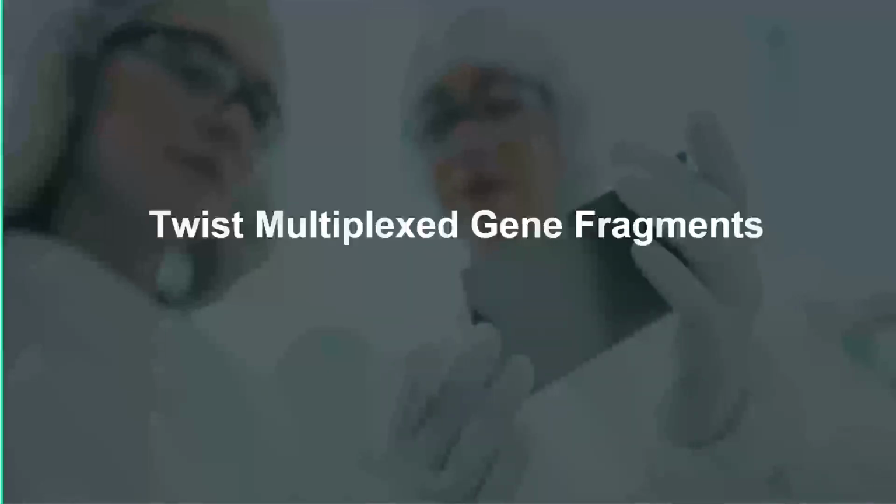So I'm just going to pause there and say, we worked with Macromoltek, who provided us with 10,000 antibody sequences. And then we went on to expand on that diversity and build a library of 10 to the 9. And when I've presented this in the past, I've often got a question to say, well, why didn't you just test the 10,000 putative binder sequences? Why then, when they've predicted that those are binders, did you go out and expand that diversity?